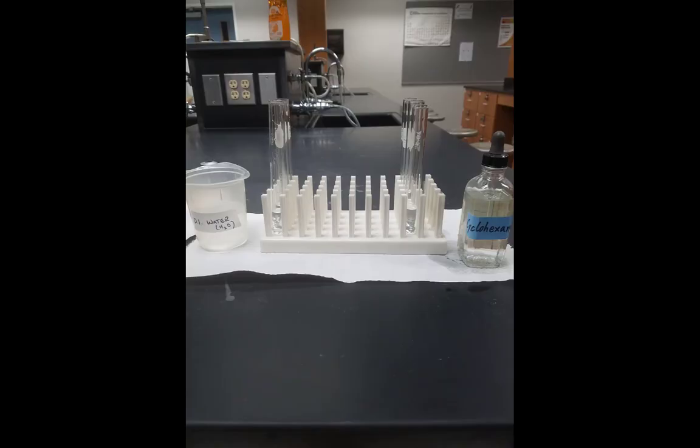In this experiment, we're going to be using a total of eight test tubes. Four test tubes on the left will be filled with DI water and the four test tubes on the right will be filled with the nonpolar cyclohexane. Each of these test tubes contains about three milliliters of the solvent that we're interested in.